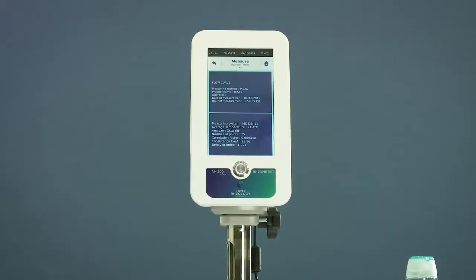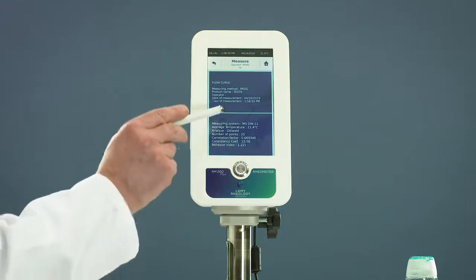At the end, the device shows all results obtained.